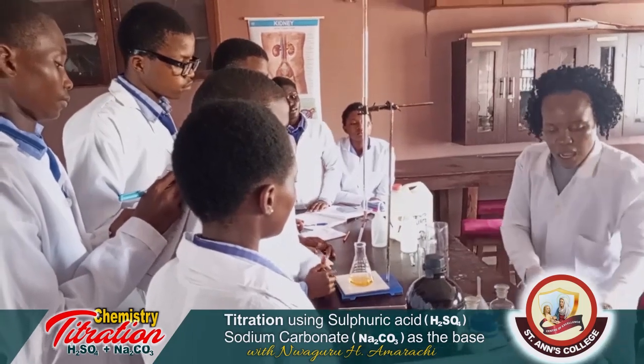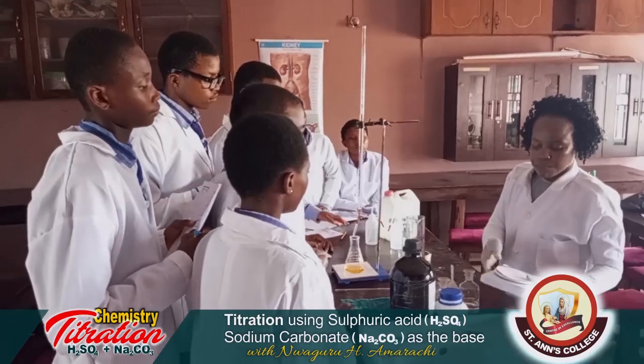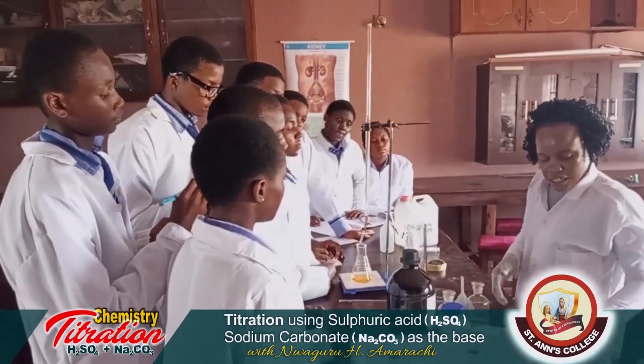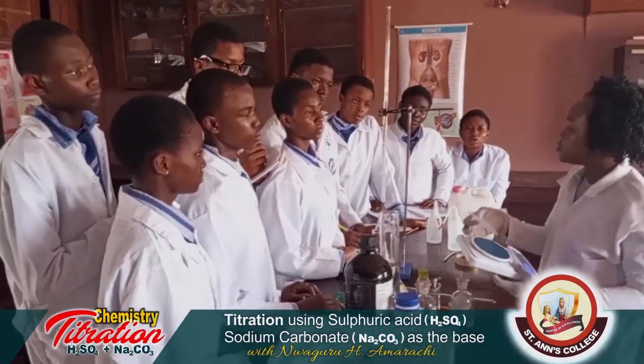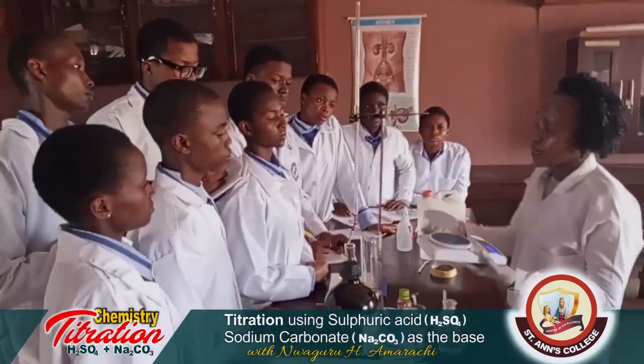Then our weighing balance. Ensure that you place filter paper on it. You don't place the base you're going to use directly on the surface of the weighing balance.